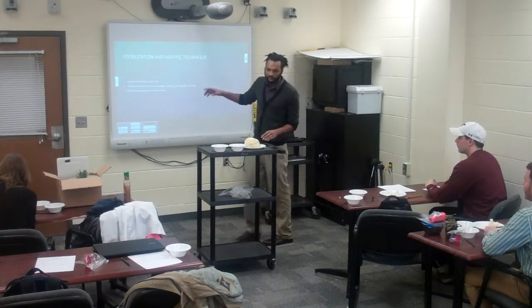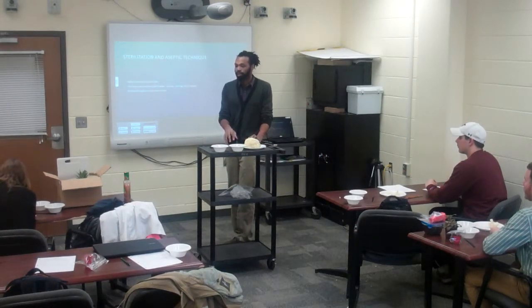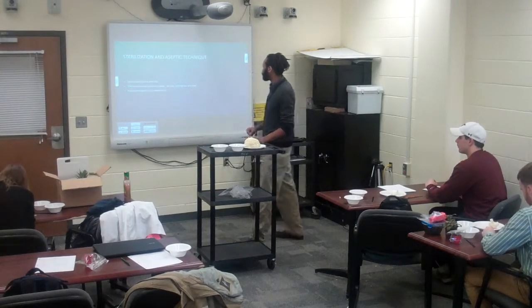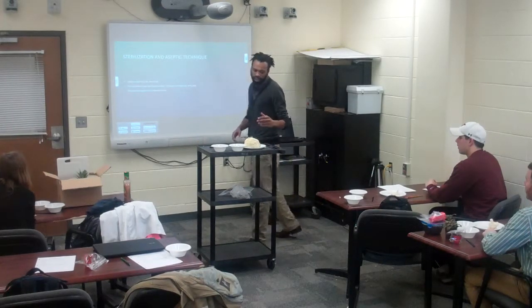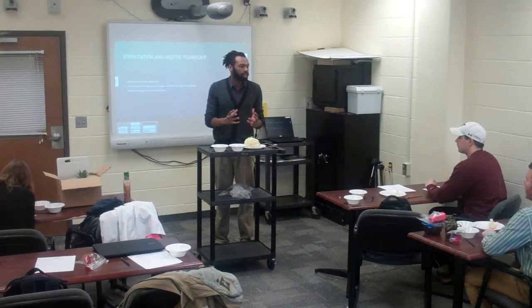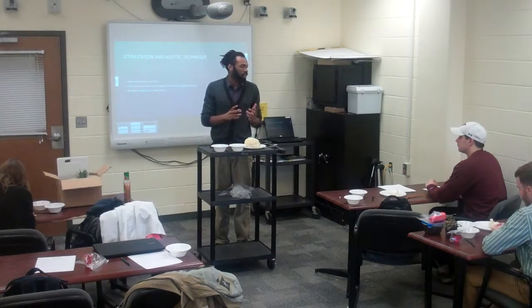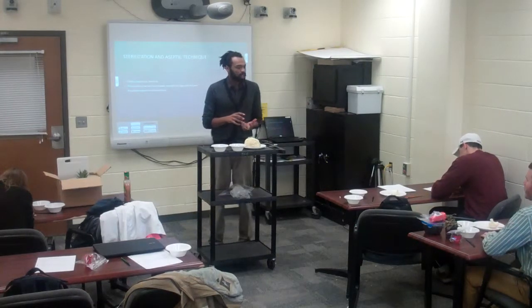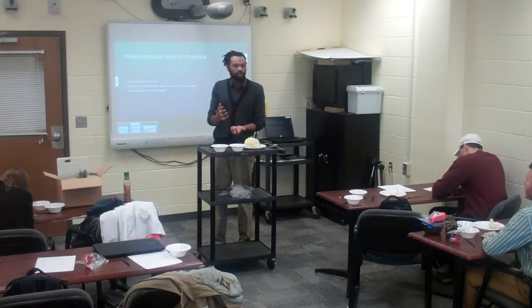So everything needs to be sterilized, from the workstation to every single tool you use, and there are steps involved in this that I will explain a little later, where you sterilize the parts of your explant. And if you're not using a petri dish, you're using a jar, because these bowls are representative of a jar, and they don't have to be a fancy jar. I've used baby jars before, but they do have to be sterilized. You don't want to keep them open. You want to make sure that no contaminated air gets around them, because that's where the spores will be.